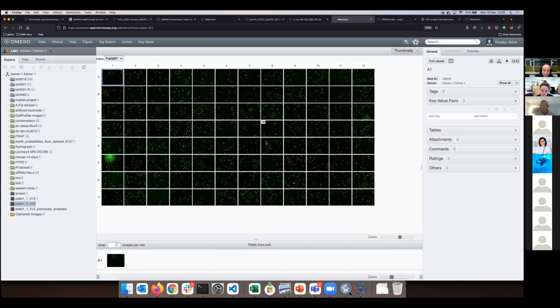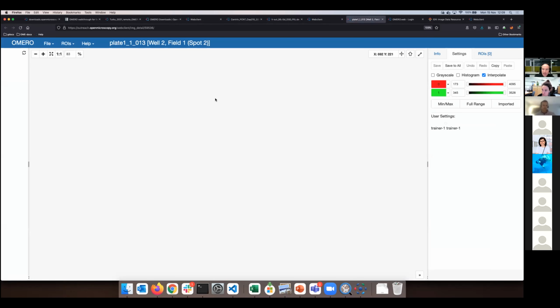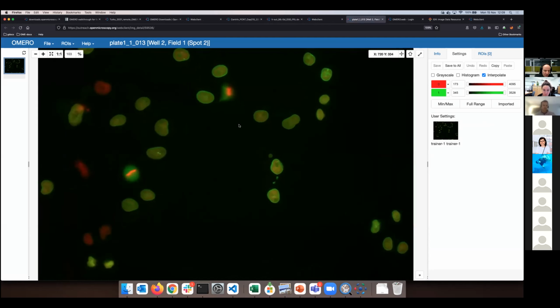The Screenwell plate format is laid out like that because that whole thing with its 96 wells, the wells are objects. Inside the well is another object called image. Okay, these are two different things. You can click on the well and the first image inside the well will open.